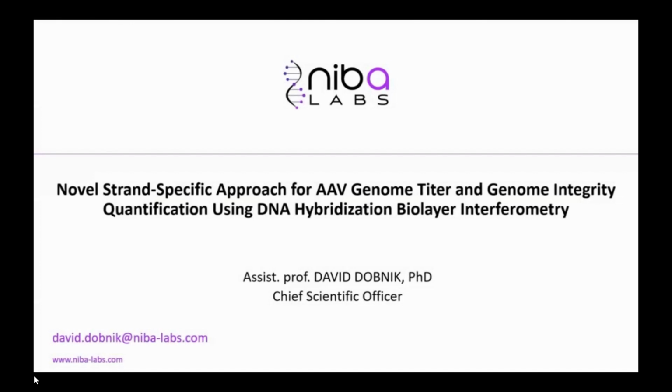Thank you, Vasu, for this nice introduction. So, as said, I'm David Dobnik, and today I will present you the topic of genome titer and genome integrity quantification using the novel approach by Biolayer interferometry.